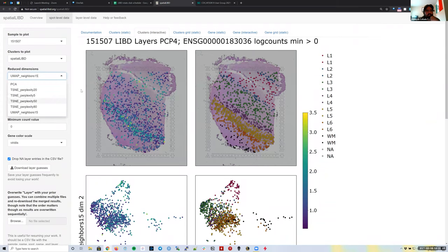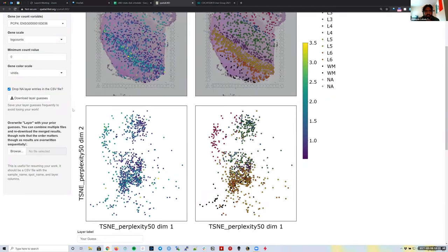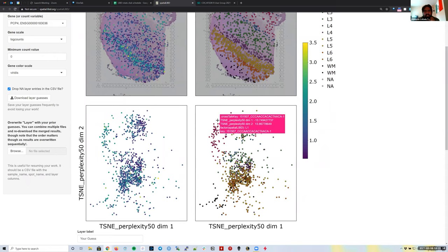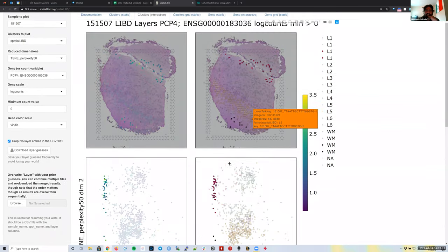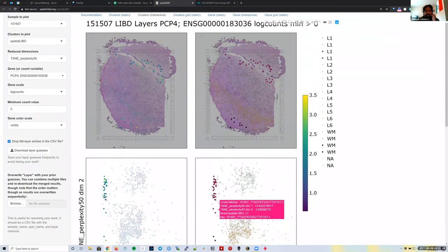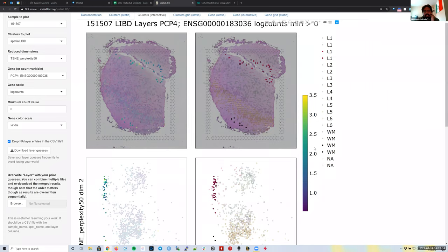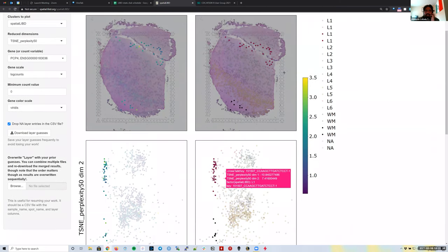Using the TSNE perplexity 50 results, I can manually select a slice of points along the x-axis for TSNE dimension one. That automatically updates the highlighted points on the spatial histology plot above. This is interesting because you can see how spots that cluster together in reduced dimensions actually correspond to layers in the tissue.